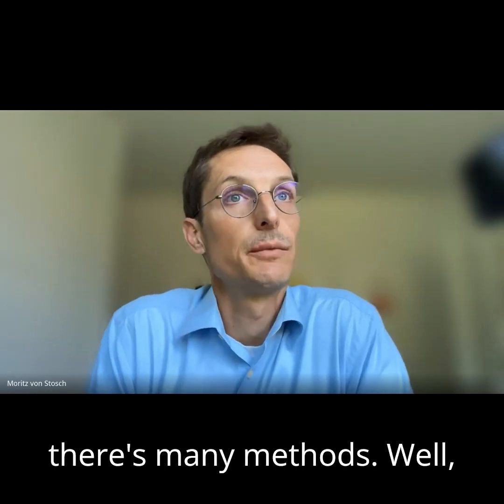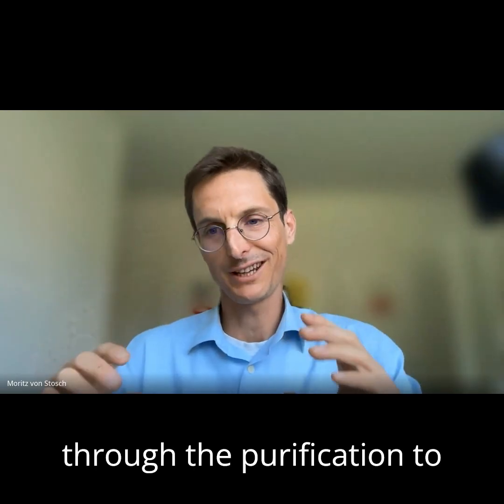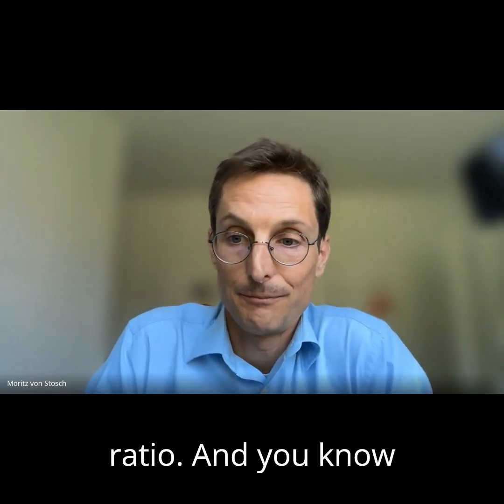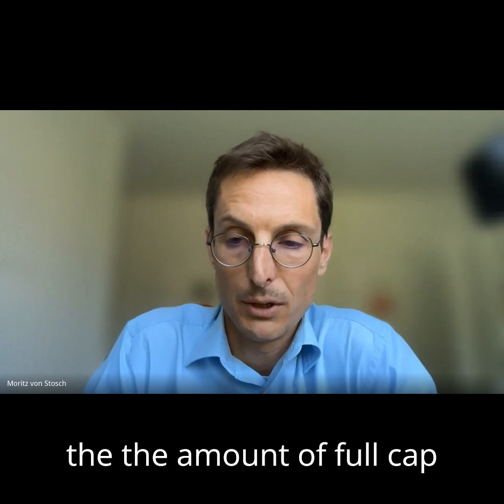Yeah, I mean, there are many methods. Well, this process is upstream, right? So we still have all the way through the purification to improve the full to empty ratio. And typically in purification, you would try to increase, of course, the amount of full capsids.